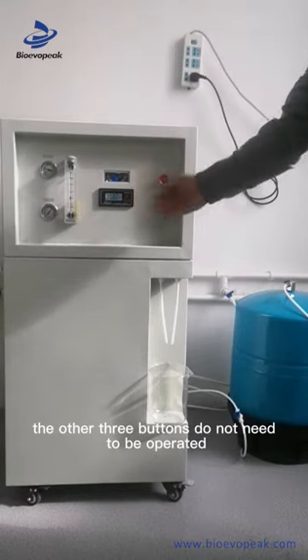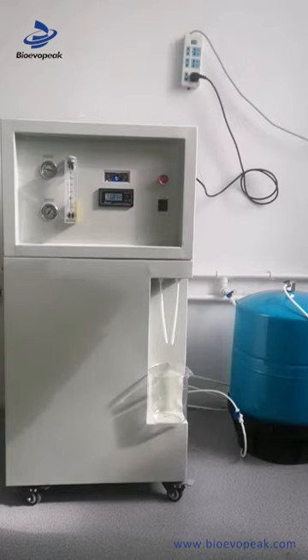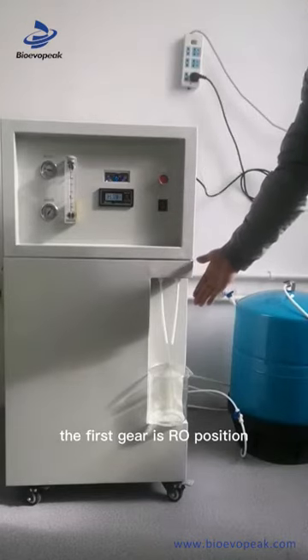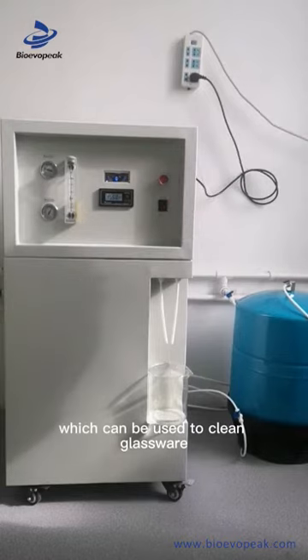The other three buttons do not need to be operated. On the water intake switch, the first gear is the RO position, which can be used to clean glassware.